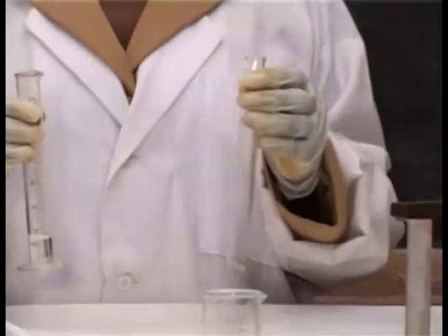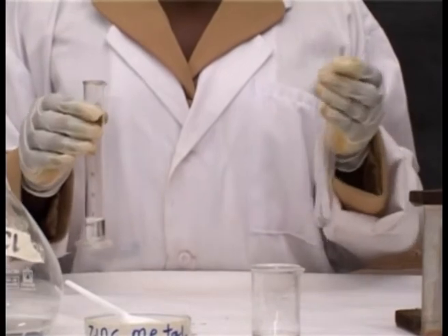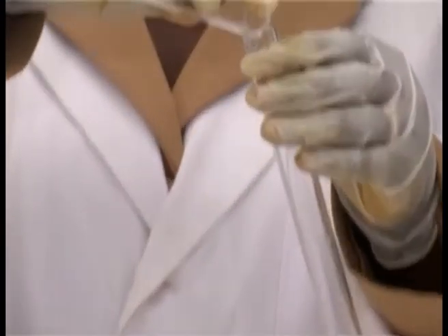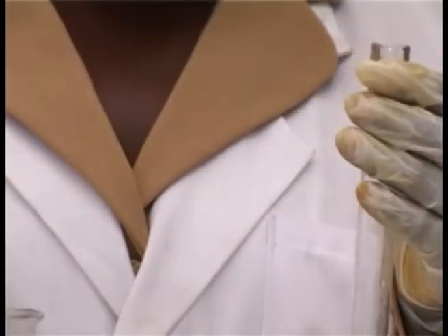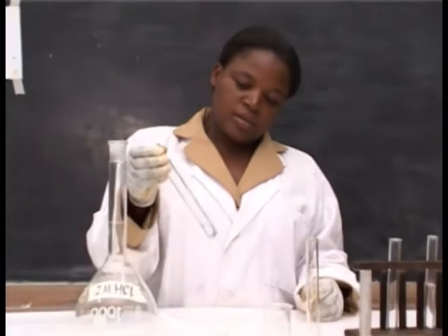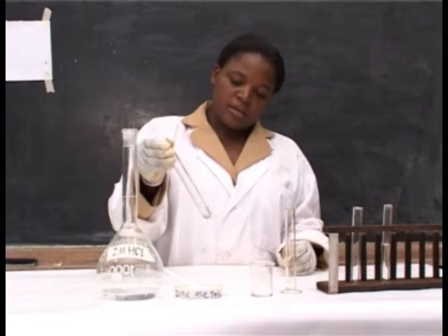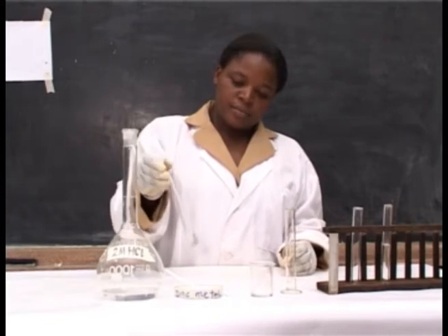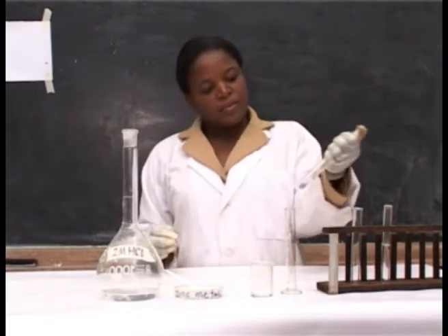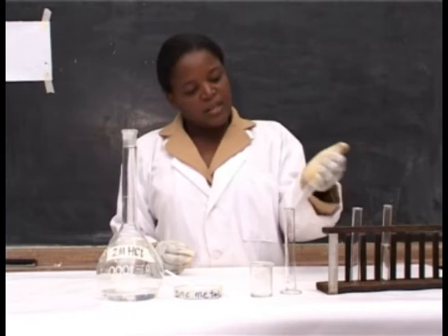Put it in the test tube containing zinc granules and observe the changes. Shake it well and place the thumb on top so that if there is evolution of gas, it won't get out.